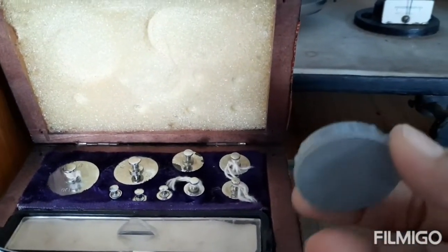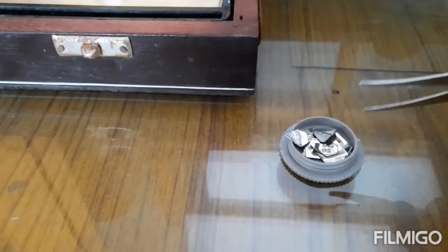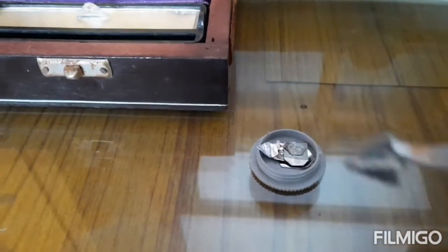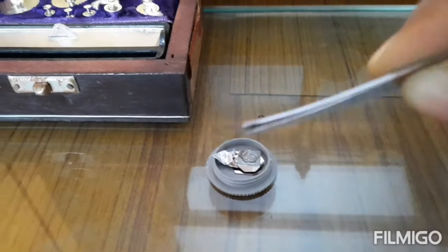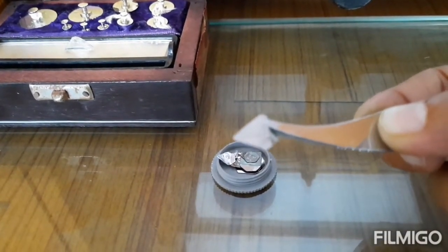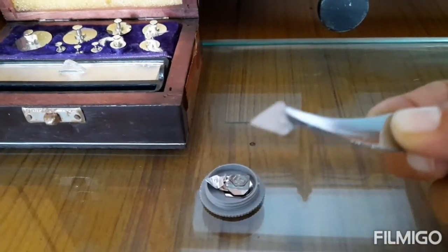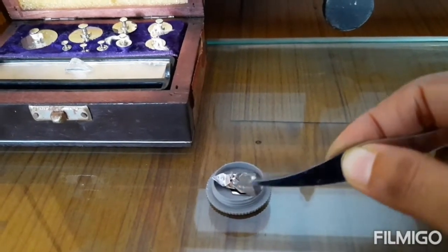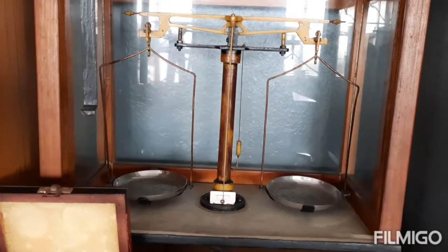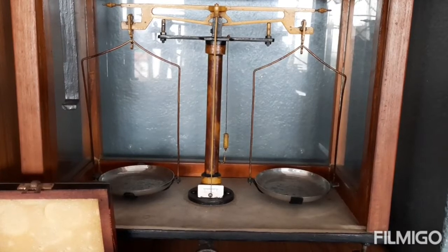Here are the weights in grams, and this box contains weights in milligrams. Milligrams are so small that we use forceps to pick up one of the weights. The weight value is actually written on top of these thin sheets.